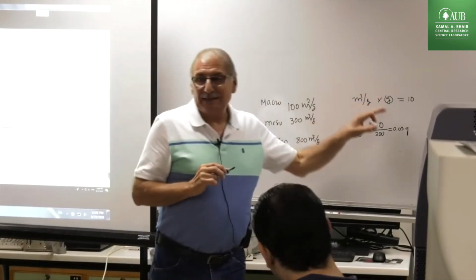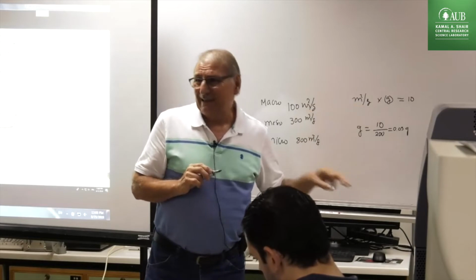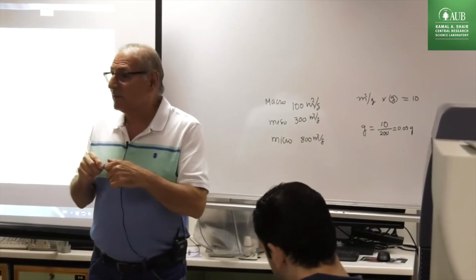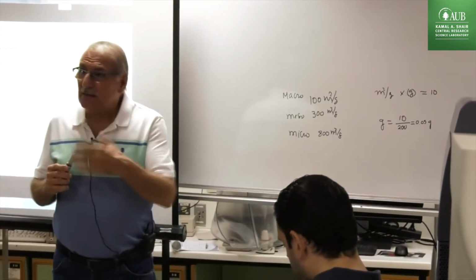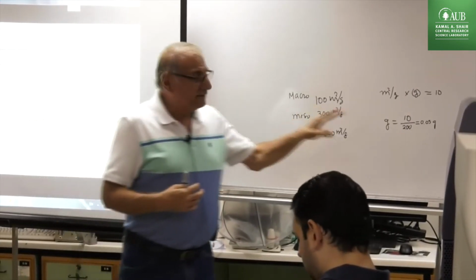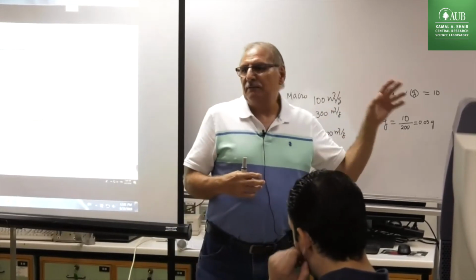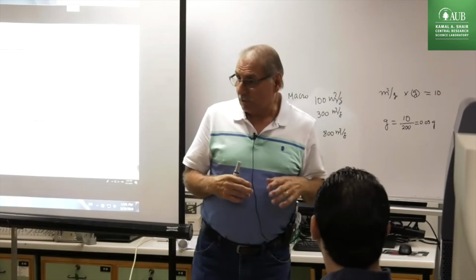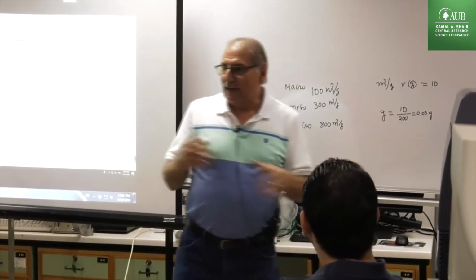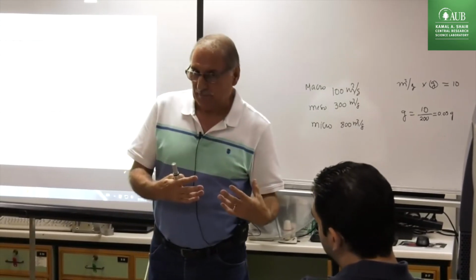If you get less than 10 meters square, 8 down to 5, it's just the limit of the detection. It means there's a small amount of gas being absorbed. So we're losing sensitivity in the measurement. But if you have 10 and higher, it will be good. But I say, why don't I take 50? I can have 50, you have very good analysis, but the time will be 3 times more. So this is a compromise to get good analysis and not long time analysis, okay?